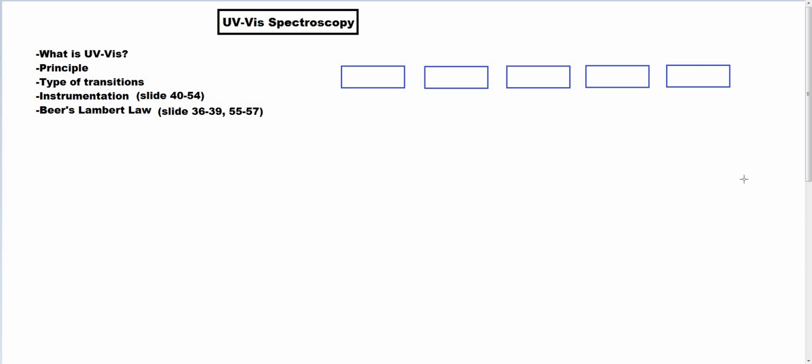Okay, so today we are going to proceed to another part in the UV spectroscopy. So last class saya dah discuss in detail. So I hope that you can go through again the lecture note and also you can have any resources to know more about what is UVs. Okay, so saya dah discuss this one regarding the principle, and also the most important one is regarding the type of the transition.